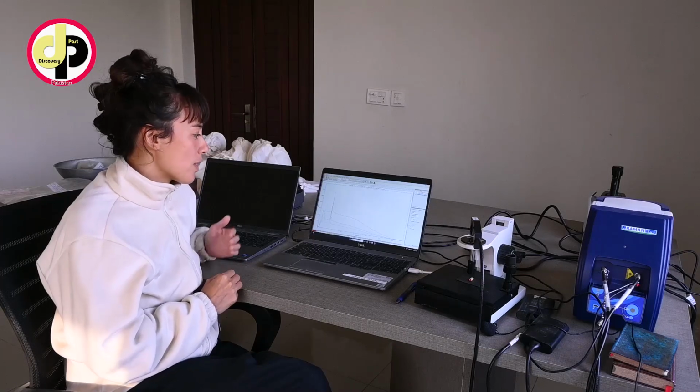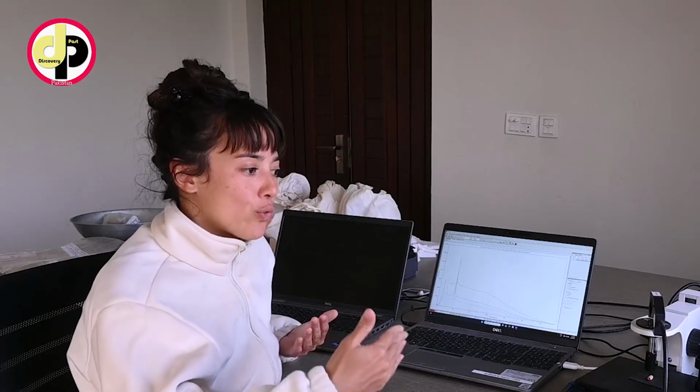So thanks to this first chemical analysis, we will know the molecular composition, but actually we also need to know the atomic composition. And so this is why we need to pursue the analysis with another instrument, and this other instrument will provide atomic identification, so it's complementary information thanks to both machines.